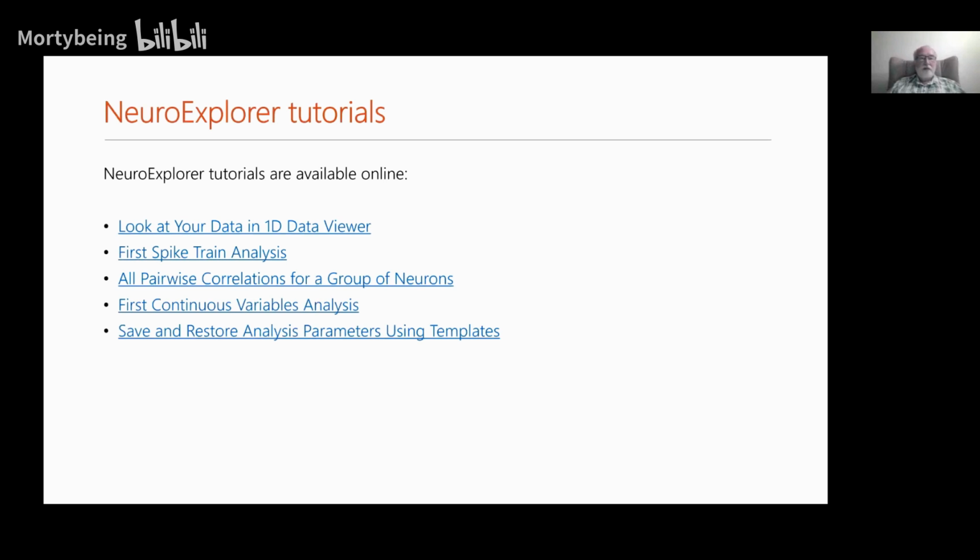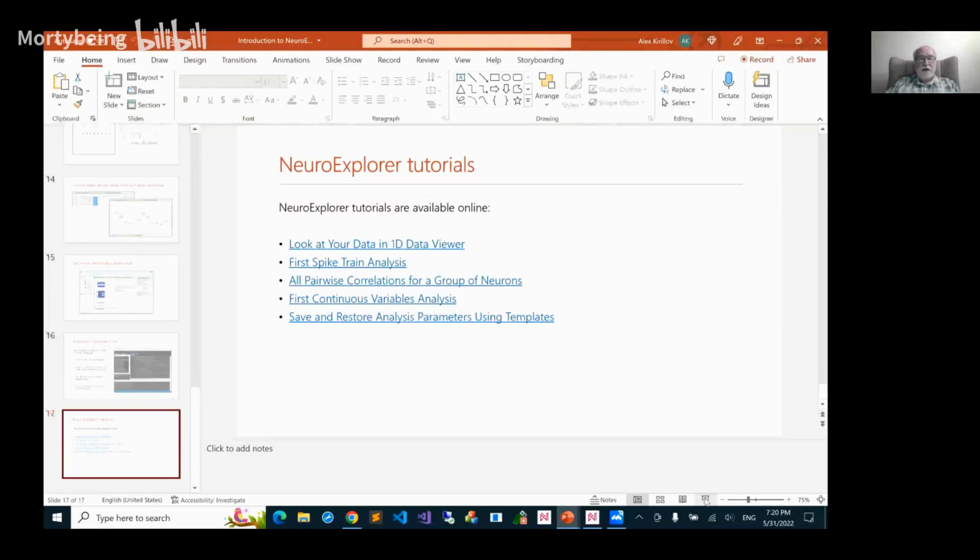Okay, and then we have tutorials online. Some of them go step by step, so you can point your customers to these tutorials, and they can see how NeuroExplorer works in general. Okay, so this is all for the first part. For the second part, I would like to open NeuroExplorer and show you how it works inside the program. Any questions?